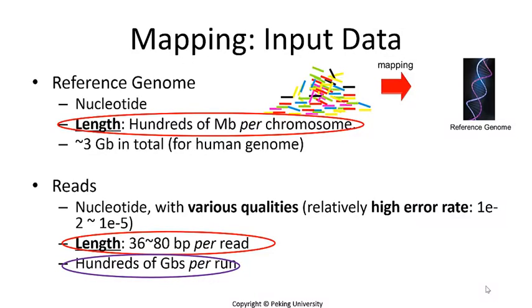Reads generated by deep sequencing can have a size of hundreds of GB. This will amount to size of dozens of individual human genomes. The third difference is the data quality. In the pairwise sequence alignment, we usually assume that the input sequence has no errors. However, the quality of the reads produced by deep sequencing is unevenly distributed, and the reads are subject to a higher error rate.